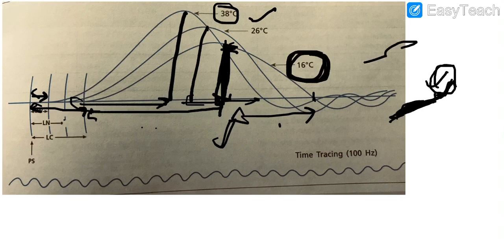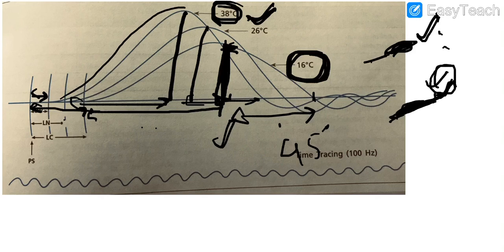That can be the second question, like how will you increase or decrease the temperature? So, your answer should be by increasing or decreasing the temperature of the ringer solution. We are continuously pouring the ringer solution over the muscle preparation, so that it keeps on getting its own metabolite. So, we will reduce the temperature. The temperature of that ringer solution is 16 degree, so obviously, that will reduce the temperature of the muscle.